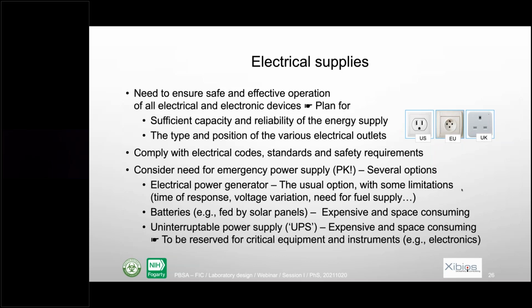Electric supply, this is not biosafety, but it's important because a number of equipment will be used in the lab. And so you need to have the right type of electricity. In Pakistan, there is one particularity, that you use different types of sockets, like the standard from US, from Europe, and from the UK. So you need to have the right one and also the right power behind that. But you also need to have some emergency power supply most of the time, because electricity is not always provided in a constant way.